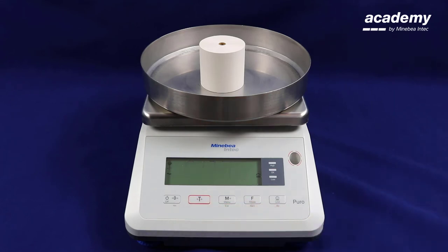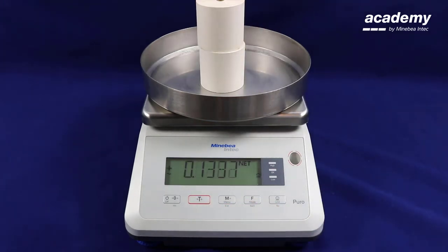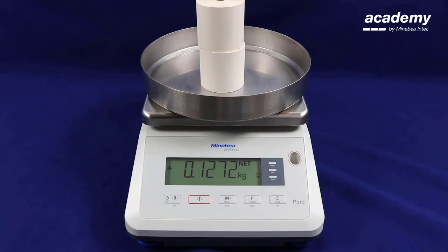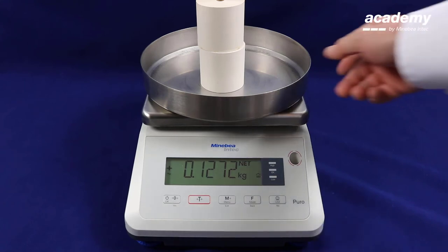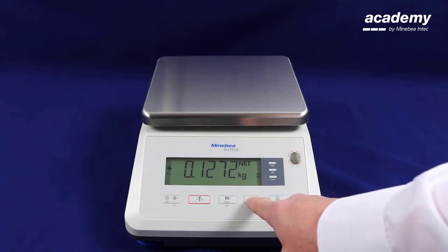Press the function key to unlock. You can press tear again and add another sample. When the symbol is flashing, the weight reading will remain on the display after you have removed the samples from the weighing pan. Again press the function key to unlock the scale.